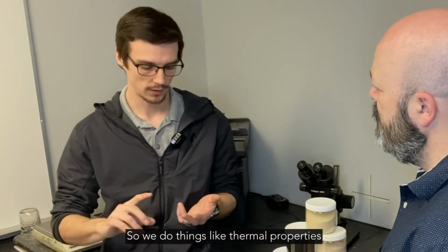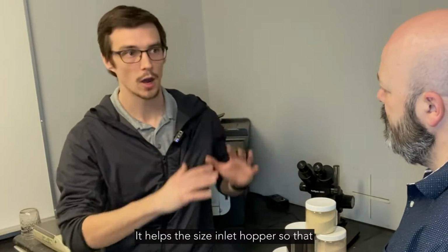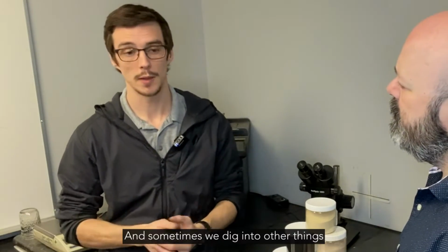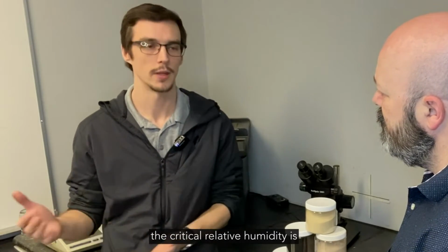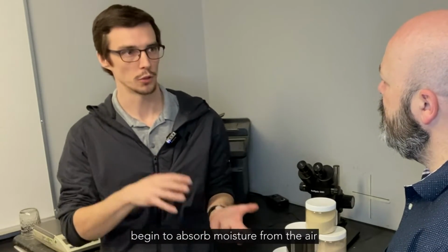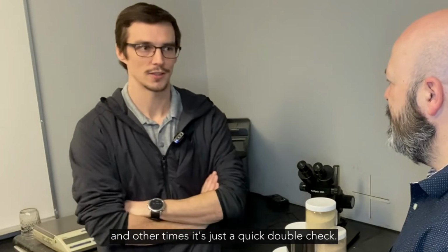So we do things like the thermal properties, flowability I mentioned. We will check bulk density. The angle of repose of the product is a really simple one. It helps us size our inlet hopper so that we make sure that all the plates get covered and the hopper at the top's not oversized either. And then sometimes we dig into other things like the way that it responds to humidity, critical relative humidity specifically, and finding out something like for fertilizer, for example, at what humidity is it going to begin to absorb moisture from the air for some given temperature. So we can go pretty deep with certain things, and other times it's just a quick double check.